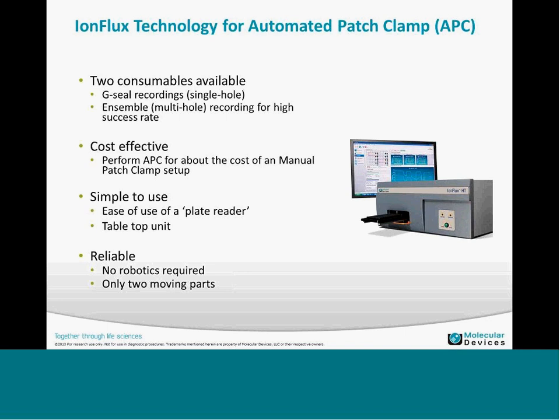So it's again very different from anything that we're used to seeing in the planar patch world. It made the cover of Assay and Drug Development Technologies in summer of 2012, I should say. And I show this because it really gives a blow-up of exactly how it works. From the experimental plan, if you blow up just where the traps are, you can see that the cells are trapped on these two red rectangular areas here, and there's a blow-up of a photomicrograph of the cell being trapped. And you'll see a movie of that in just a moment.